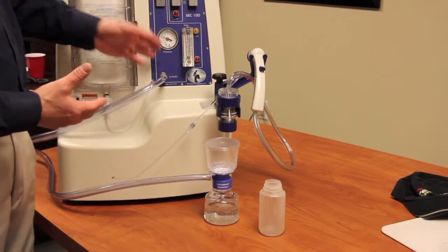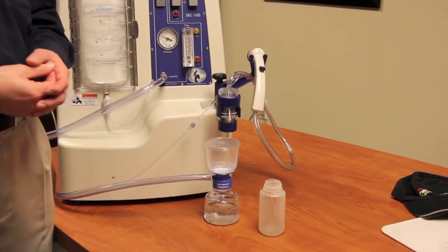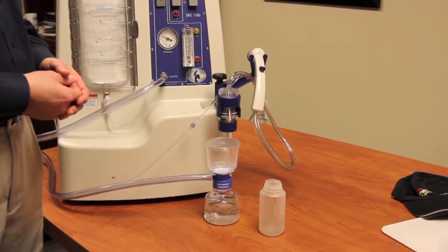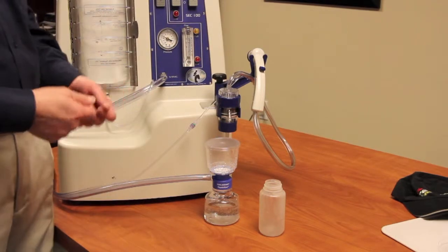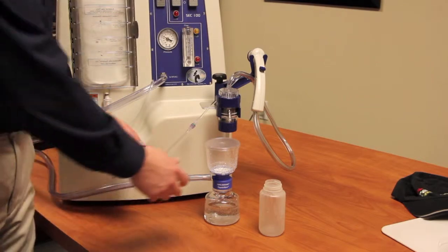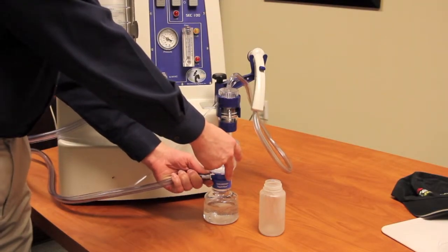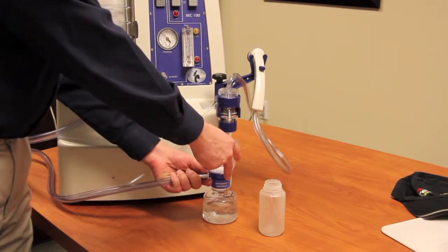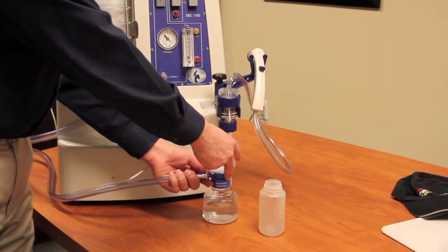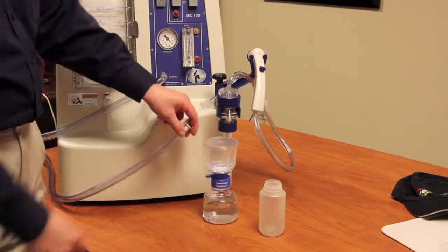Lastly, you notice here there's still vacuum pressure on the filter. So the way you want to do this is to just gradually release the pressure. You can either do that just by leaving it alone for a while, or if you're impatient like I am, you can just gradually work this tube off, and you'll hear the air let in there, and now it's ready to be released.